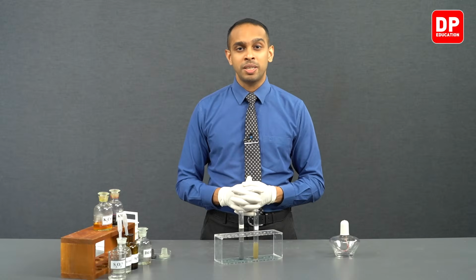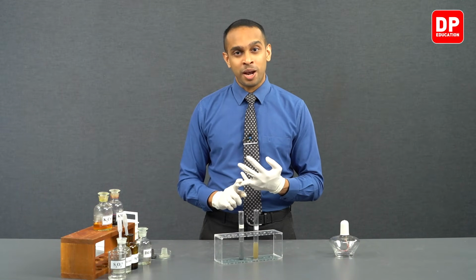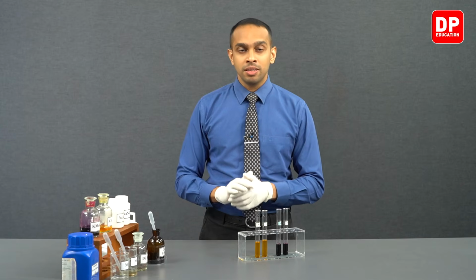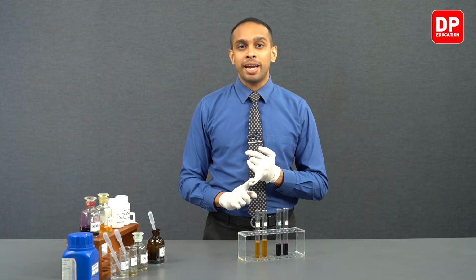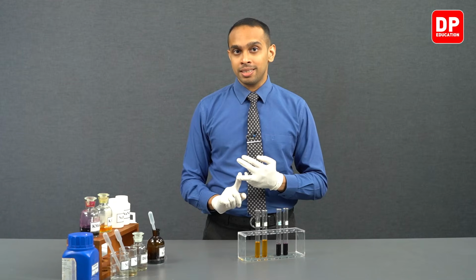Now, let's move on to the next part of this experiment, where we observe what type of experiments can be done to identify the presence of nitrate and nitrite ions. Now, students, we are going to observe what will happen when we take nitrate ions and nitrite ions and react them with acidified potassium dichromate and acidified potassium permanganate.